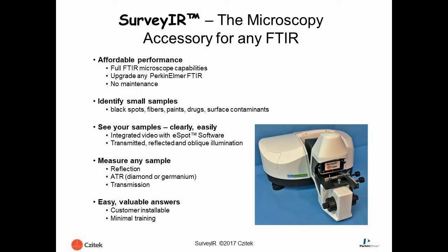Surveyor is the microscopy accessory for any FTIR. Surveyor is very affordable and can upgrade any FTIR spectrometer, providing full FTIR microscope capabilities.